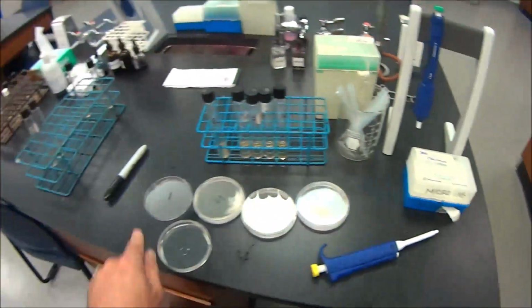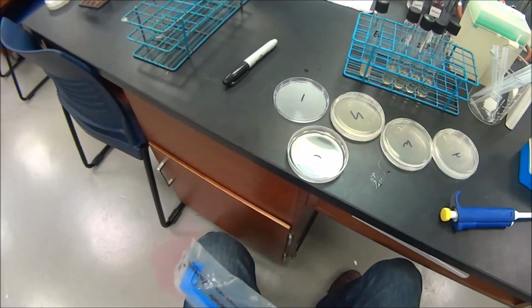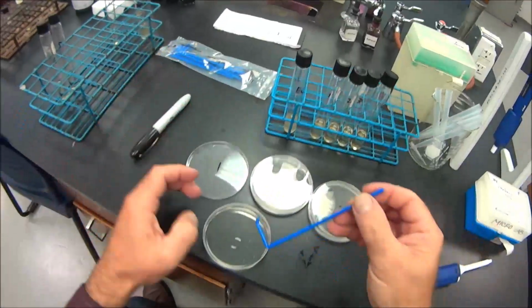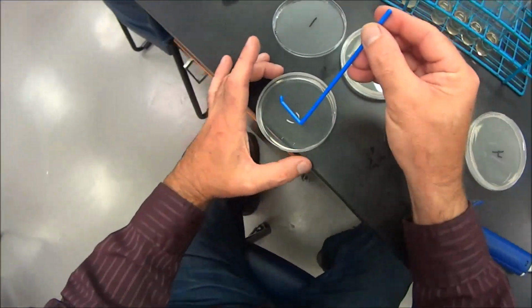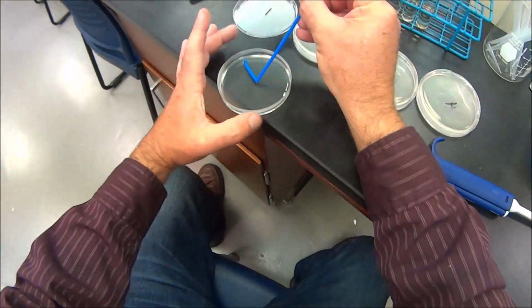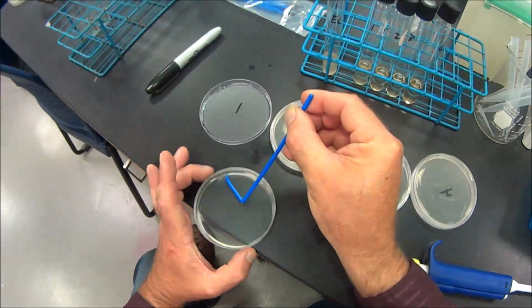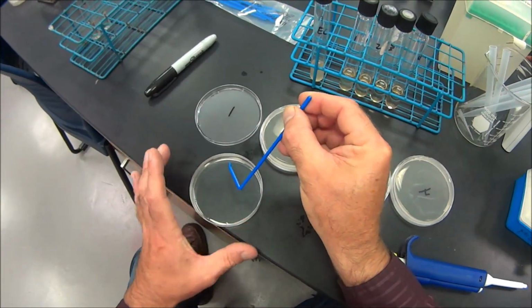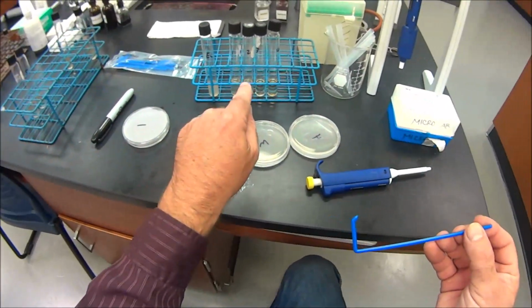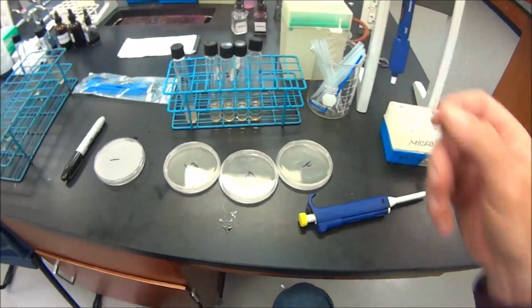Now, to streak it across the surface of the petri plate, we're going to use these L-shaped cell spreaders. And the way this works is you simply rotate that around, and you're getting an even thin coat all over the surface. And we'll repeat that with tubes 2 through 4.